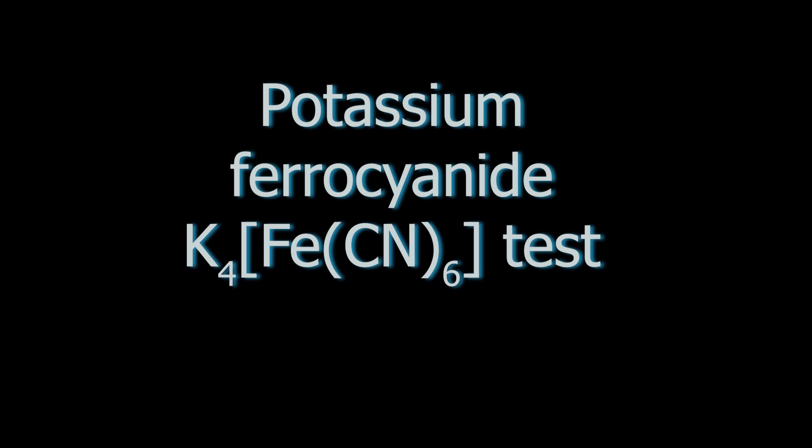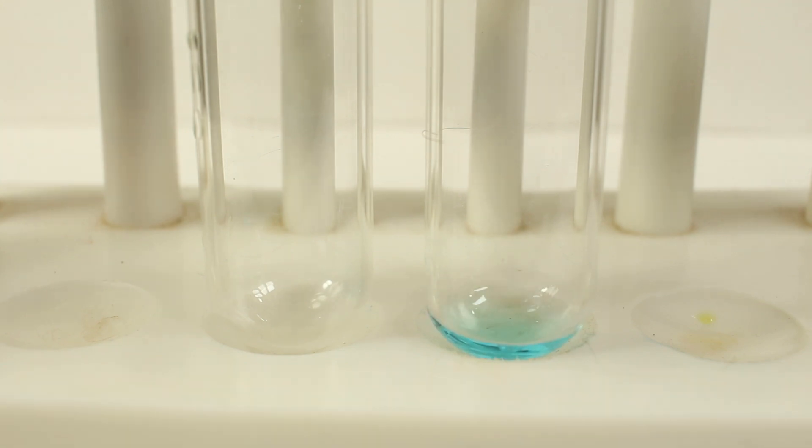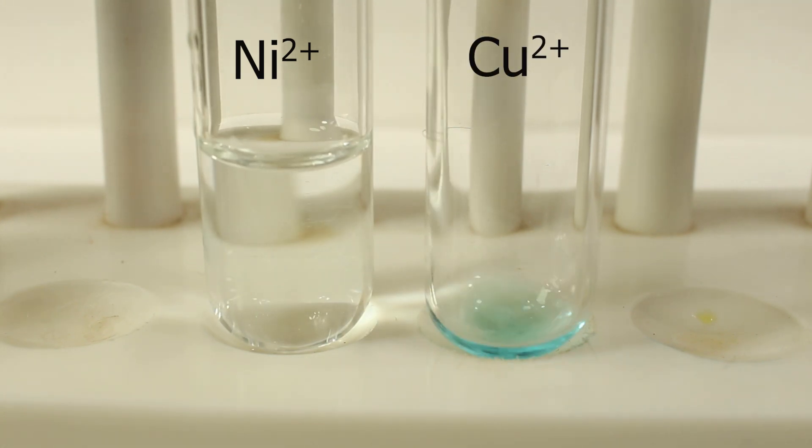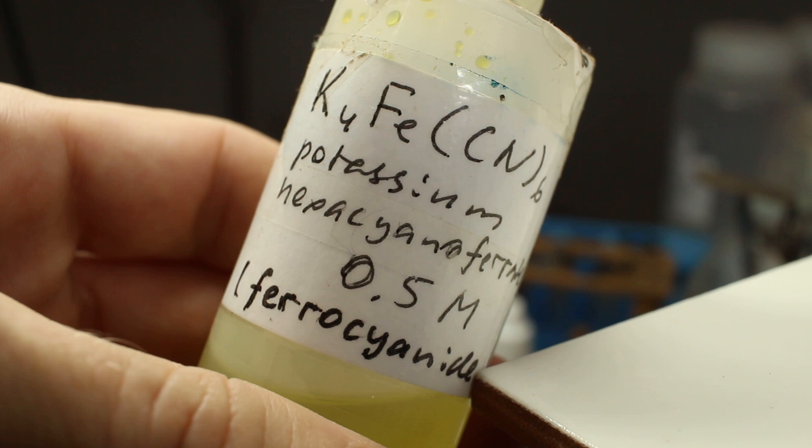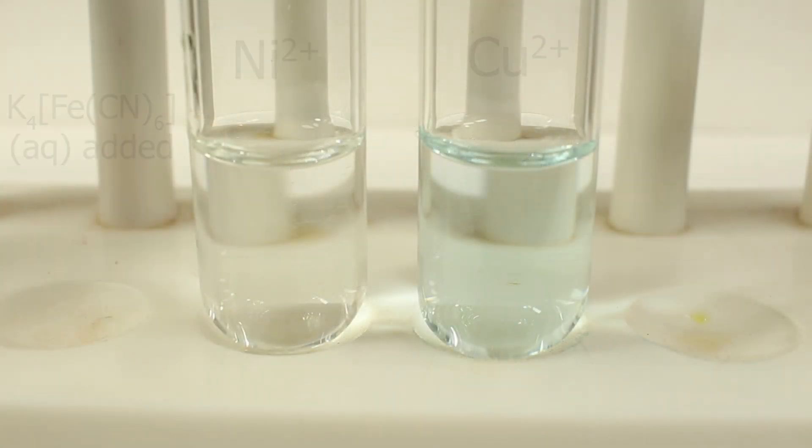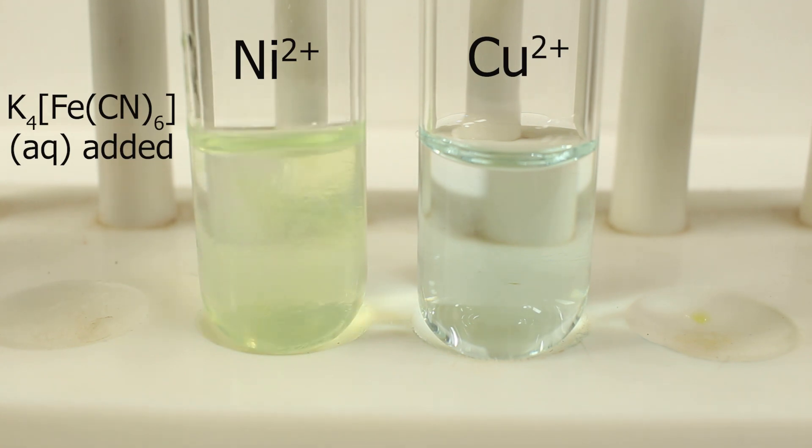Potassium ferrocyanide. Another complex formation. We use same pair: nickel-2-sulfate, copper-2-sulfate. And potassium ferrocyanide or potassium hexacyanoferrate II in IUPAC nomenclature. Our ions here to form complexes, iron II surrounded by six cyanide ions.